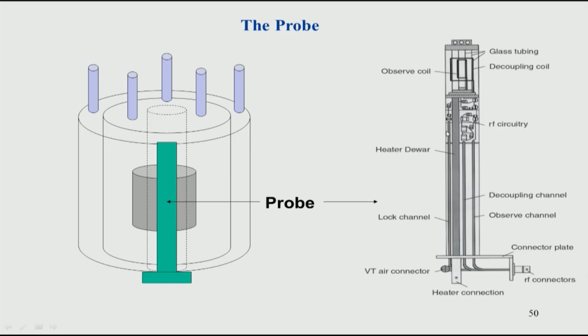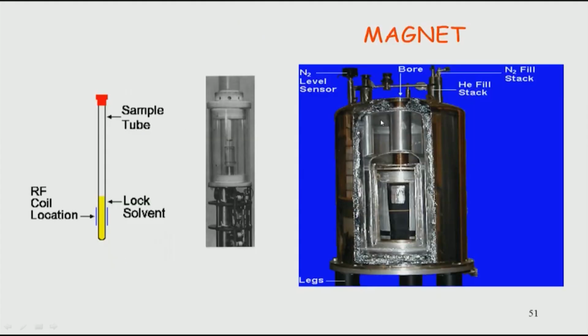The probe is a very important part, because this is where we actually apply the energy to the sample, and that is where the resonance concept comes into the picture. We will look at more of this probe.